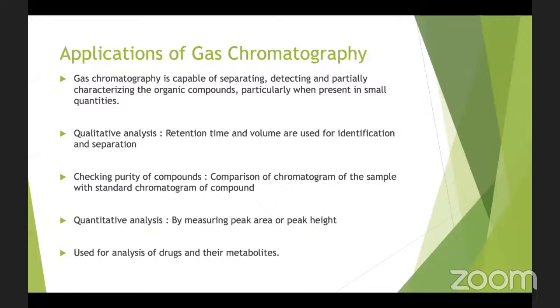Now, applications of gas chromatography. It is capable of separating, detecting, and partially characterizing organic compounds, particularly when present in small quantities. Retention time and volume are used for identification and separation. Then for checking the purity of a compound, the chromatography of the sample is compared against the standard chromatogram of the compound, and this is how the percentage purity of the compound is calculated or identified.